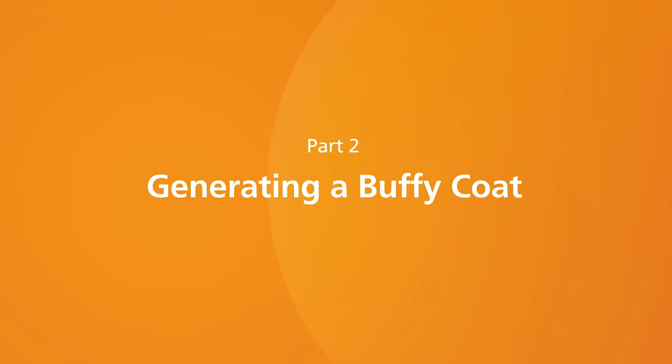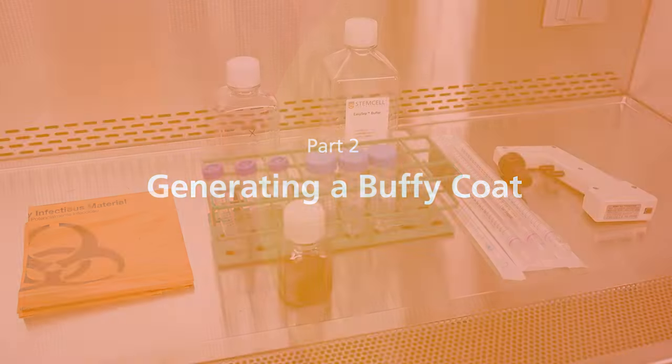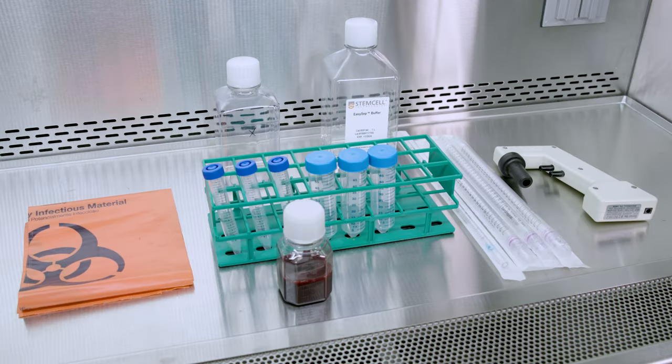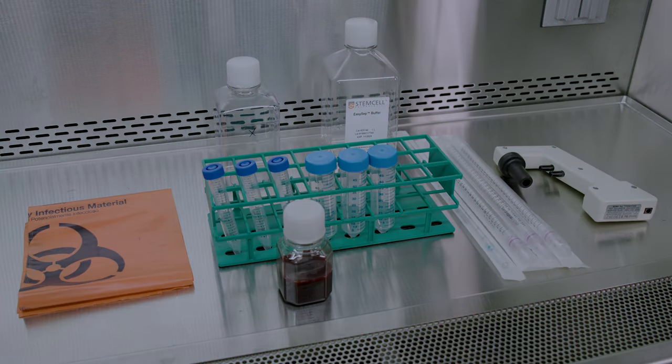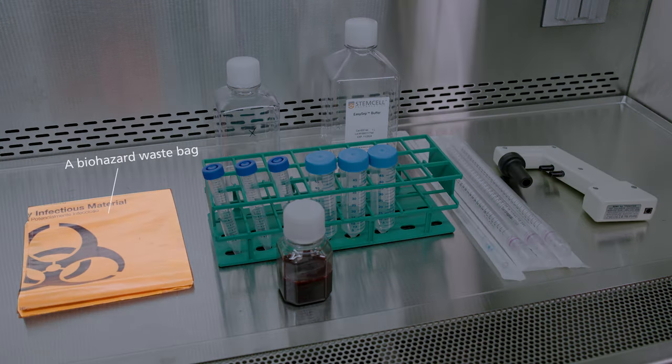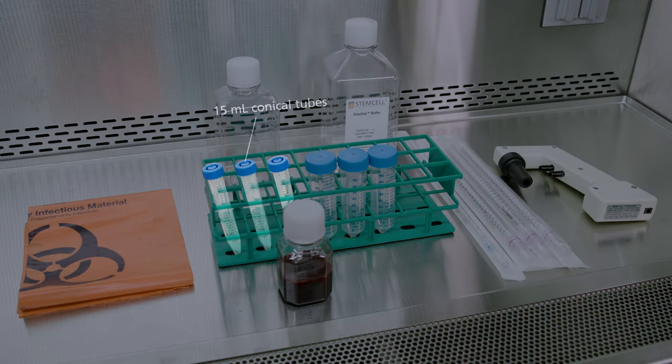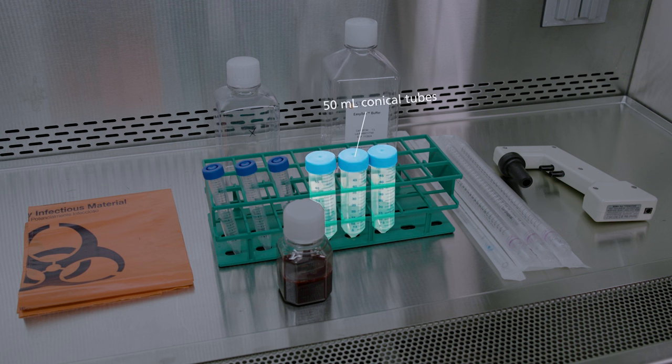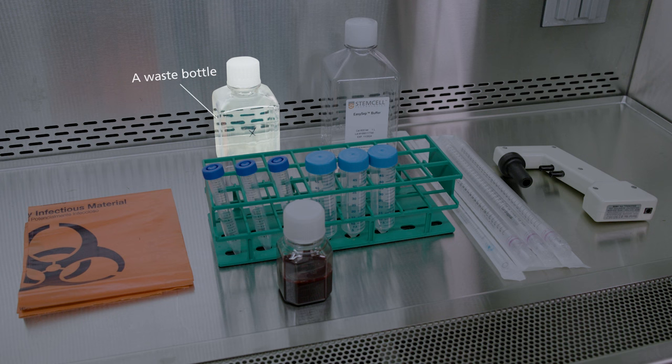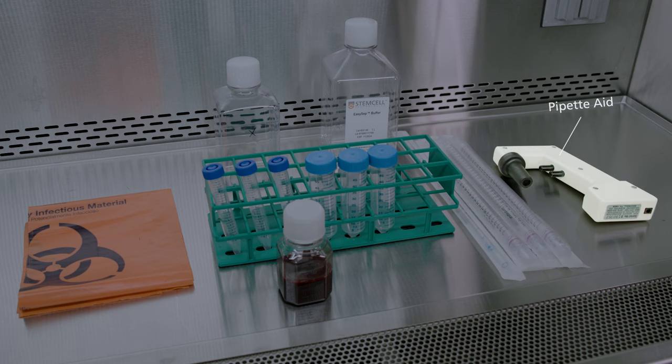Part 2. Generating a Buffy Coat. To generate a Buffy Coat from whole blood, you will need the following items: a biohazard waste bag, 15 mL conical tubes, 50 mL conical tubes, your whole blood sample, a waste bottle, buffer, 5 mL serological pipette, 25 mL serological pipette, and pipette aid.